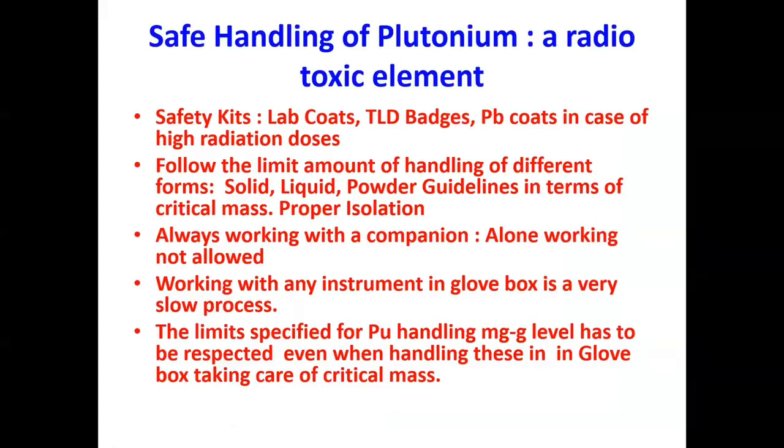And why does it become so? Because you have to follow the safety norms. You have to wear a lab coat and TLD badges, and lead coats in case of high radiation dose. Follow the limits of handling of different forms, solid, liquid, powder, guidelines in terms of critical mass. Proper isolation is required. Always work with a companion, you cannot work alone. Somebody should be present. Working with any instrument in a glove box is a very slow process, as I already told.